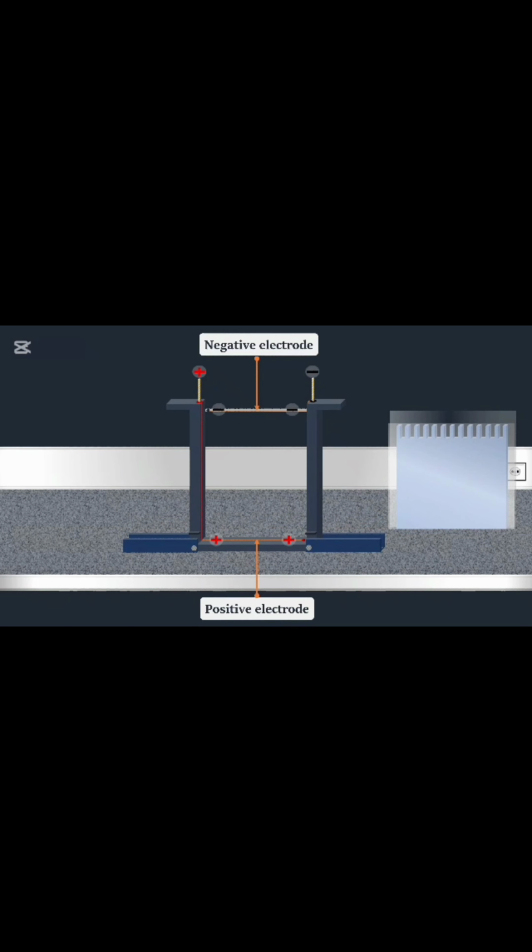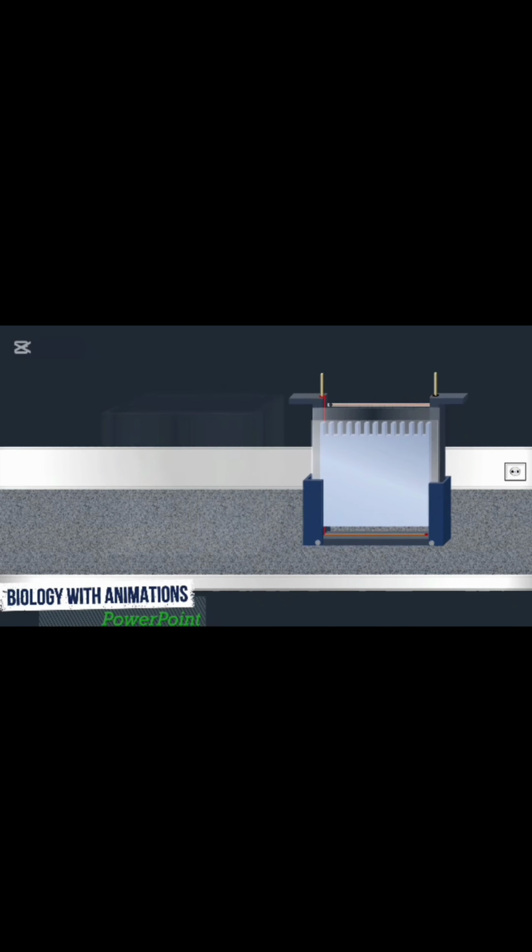Once the gel is completely polymerized, the comb is removed and the gel cassette is placed vertically between two electrodes. The positive electrode is located at the bottom of the gel, whereas the negative electrode is positioned at the top of the gel. The gel is inserted into a chamber and a Tris-glycine-chloride buffer system with a pH of 8.3 is produced to allow the conduction of electricity through the gel.